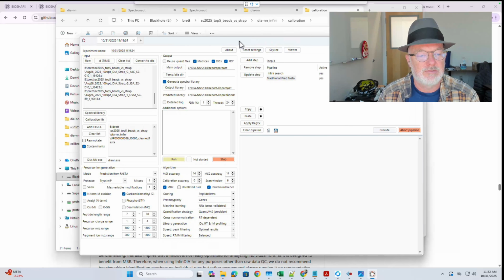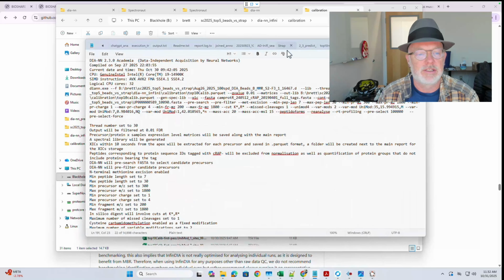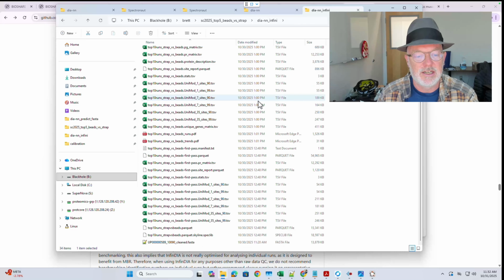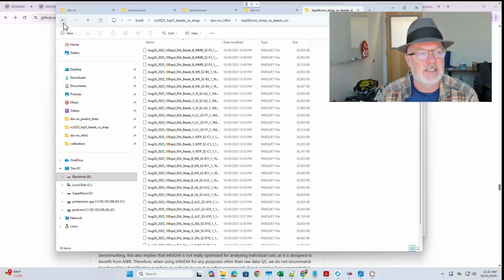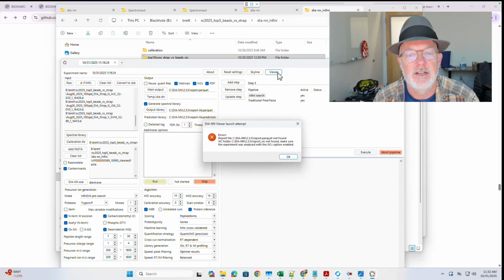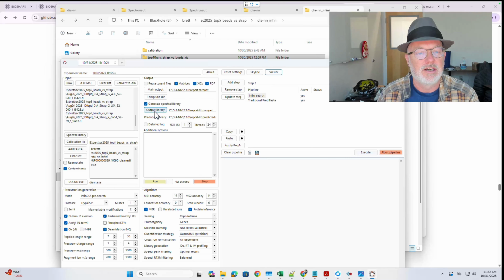So let's look at the output, and let's see when you're done. Let's look at the file. Okay, and this is the results from the infini search. You should see a ton of different files in your directory. You'll have the directory for your XICs. You can get an XIC viewer through here. You just hit a viewer, and then once you set that main output or output file, it should do that.